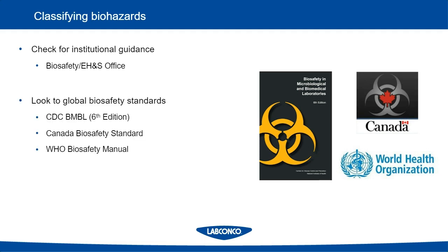Next, you can look to the global standards. So this is kind of the book I mentioned to the right. The Biosafety in Microbiological and Biomedical Laboratories book is a free guide put out by the CDC. It's now currently on its 6th edition, and you can download this online.